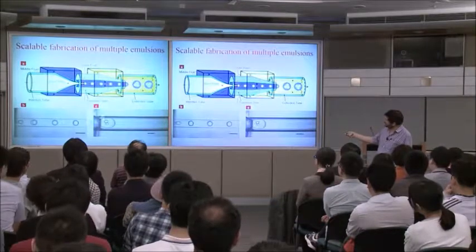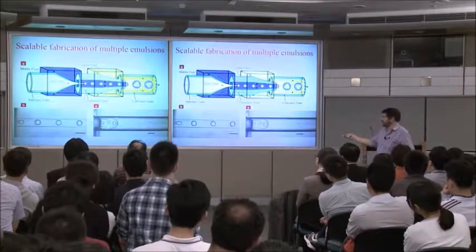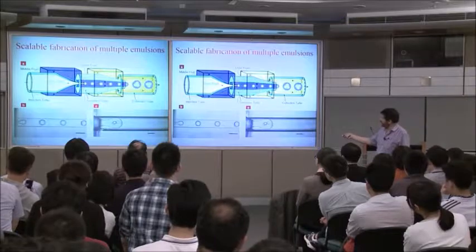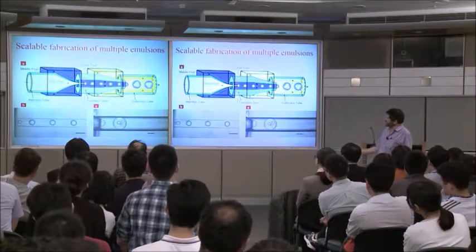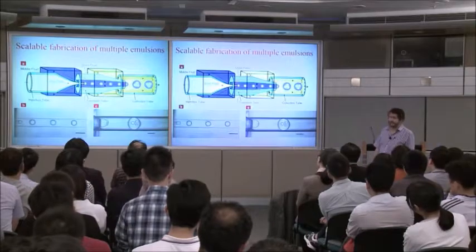So these drops are collecting here. So look, you have two drops here, and along comes a third. I've watched this movie many times. Along comes a third drop, and this breaks off now, and everything starts again. And now you have really perfect control. So now you can make what I call designer emulsions.